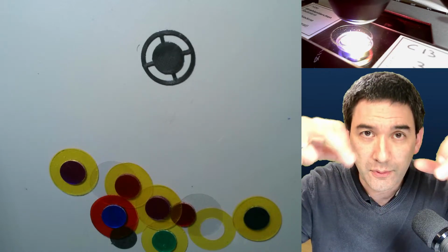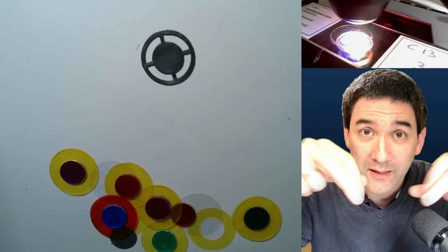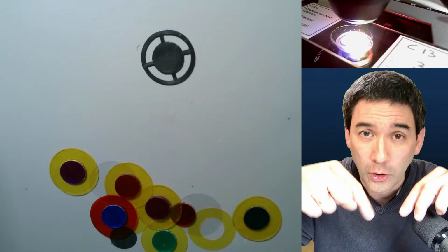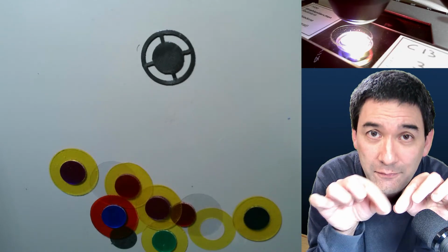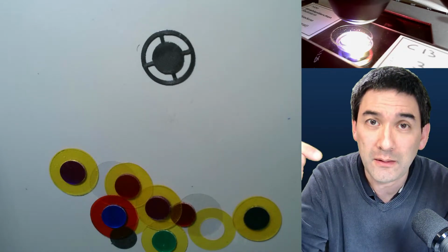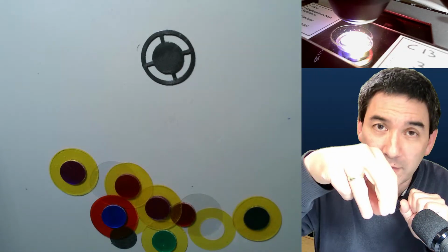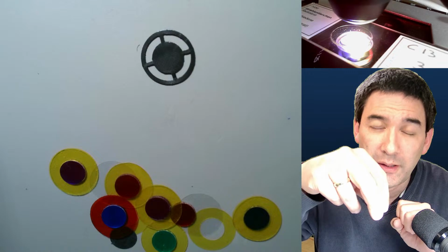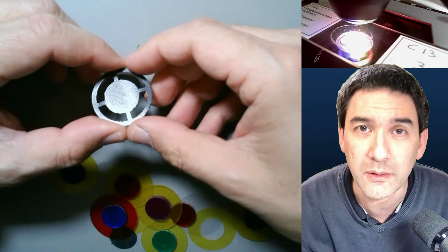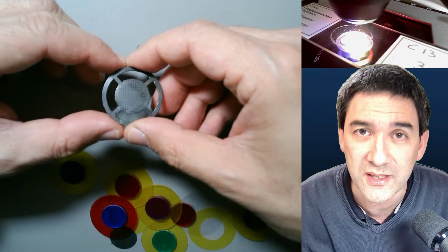There is a separate light path inside the objective to illuminate the specimen from the top, and in the center you have the lens where you can actually look at it. So the light is coming from the top, and you're also viewing it from the top. This is like in UV fluorescent microscopy. You're using a similar technique.